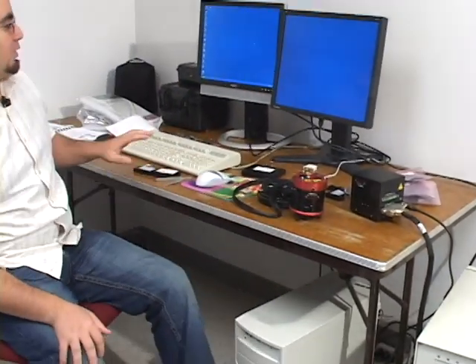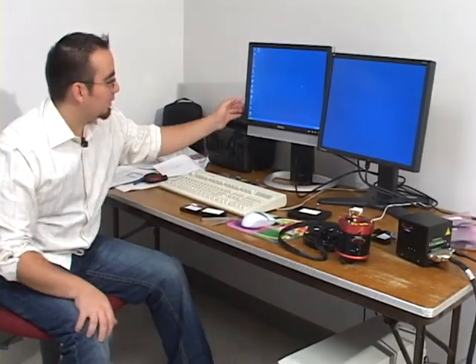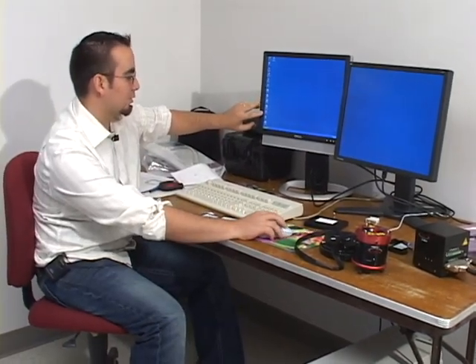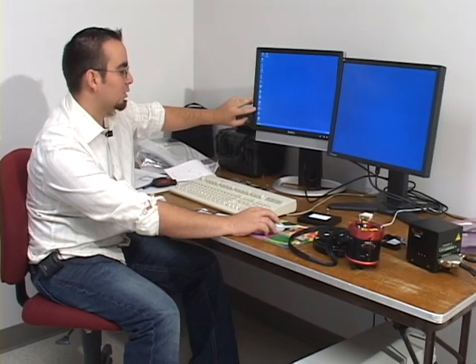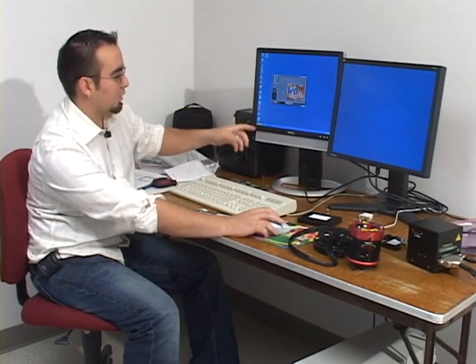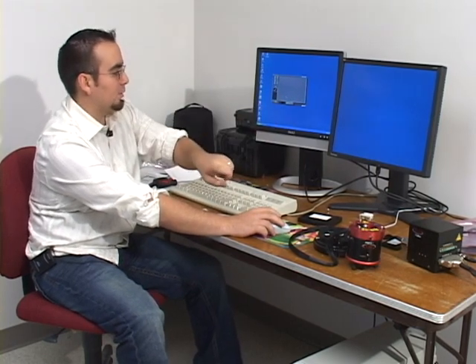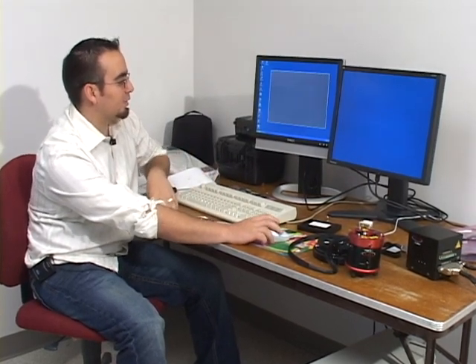Afterwards, come back to your monitor and turn on the WinTV 2000 icon right here first. So double click that and you'll have a little video monitor. And this is the video coming from the head. Right click it to get rid of the borders.